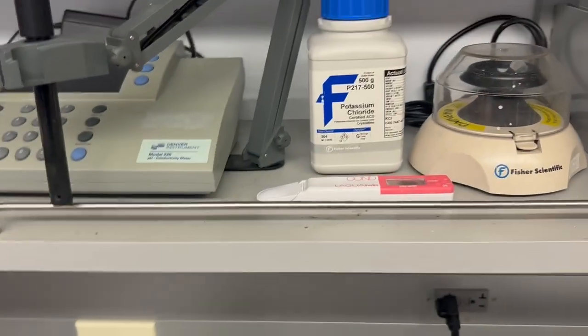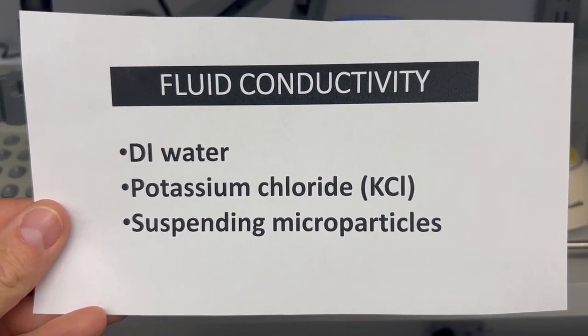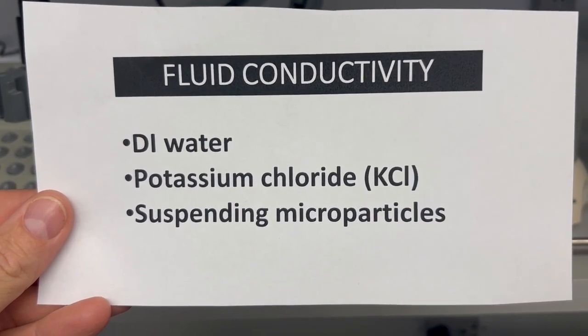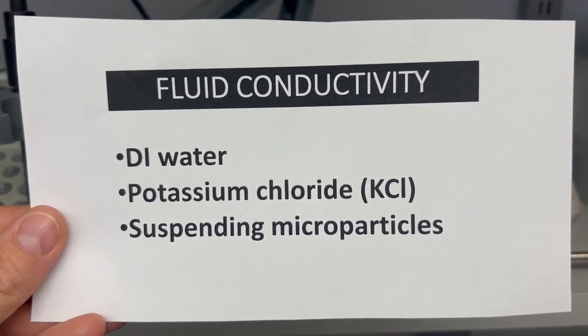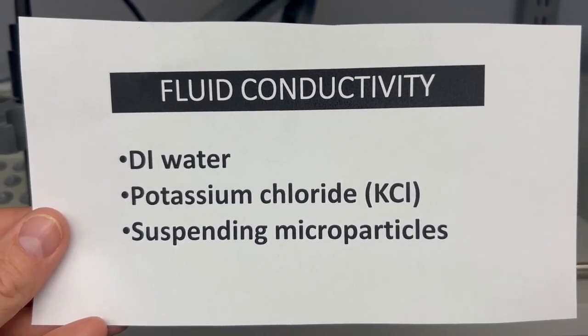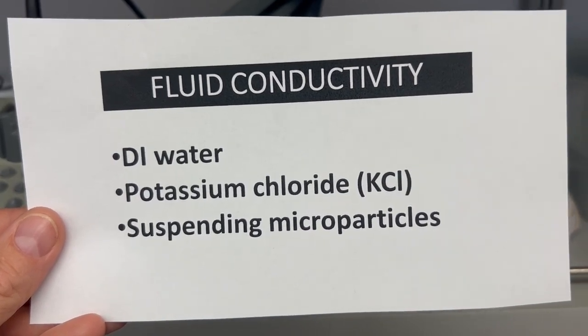So the topics that we're going to talk about today are DI water, where DI stands for deionized water, the use of potassium chloride in our experiments, and also how to suspend and resuspend microparticles. So first is DI water. Not all DI water is the same.